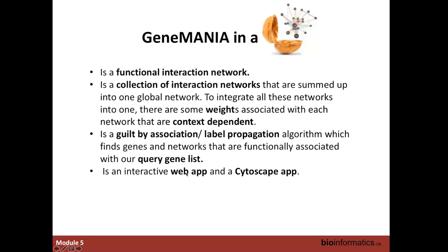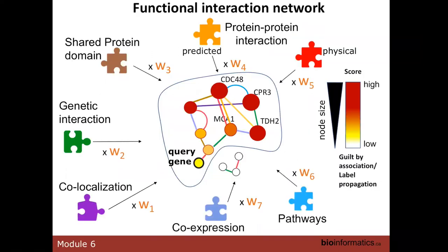GeneMania is available as a web app or as a Cytoscape app, and we are going to show you both options today. The different network types — represented like puzzle pieces — include protein-protein interaction, shared protein domain, genetic interaction, co-localization, co-expression, and pathway. Each network has a weight, and all of these are combined into a global network. Edges represent these different networks and are colored by different colors depending on the network type.